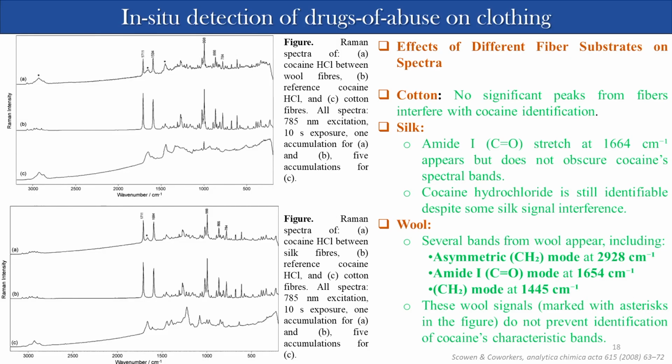Because this will be used for the real purpose. If you say that this lab can detect drugs in a crime scene, then police will come with a sample, say a woolen sample. If you have not studied previously, if you do not have a database, then you cannot accept the sample. You cannot use a woolen sample if you have just a data set for the cotton one, because you are going to help police convict somebody.